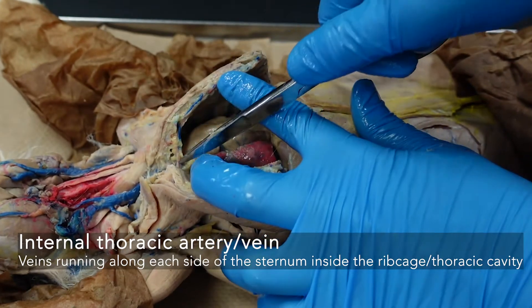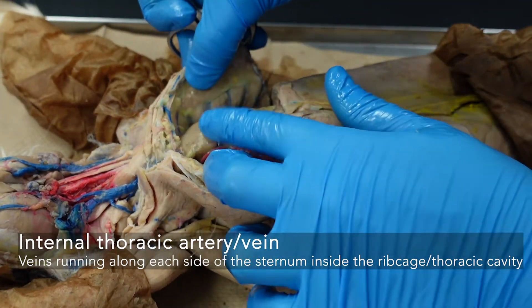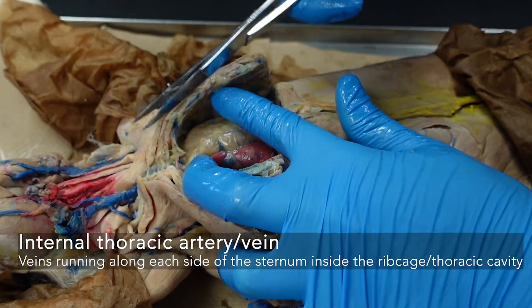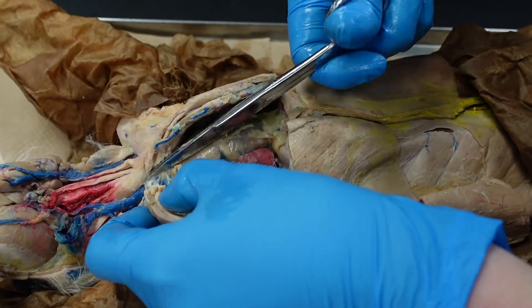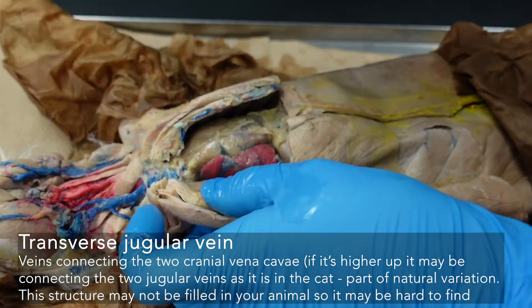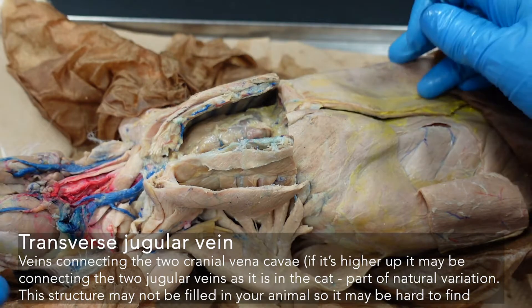You may see your internal thoracic vein and artery running along here — this is the right internal thoracic. I was trying to get close to it, but we have one on the other part of the ribcage to identify as well. In order to open this up, we will be cutting through that just a little bit. Up in this region I'm also keeping a close eye for the transverse jugular — it will be a connecting point making kind of an H between the two external jugular veins. It may not be filled in your rabbit, so don't distress if you can't find it.